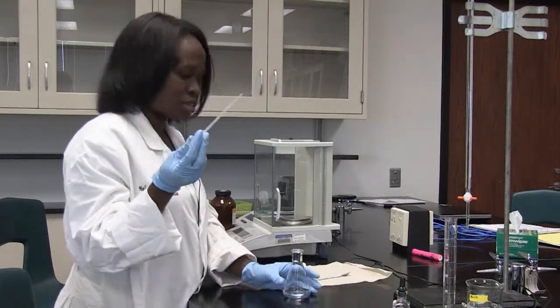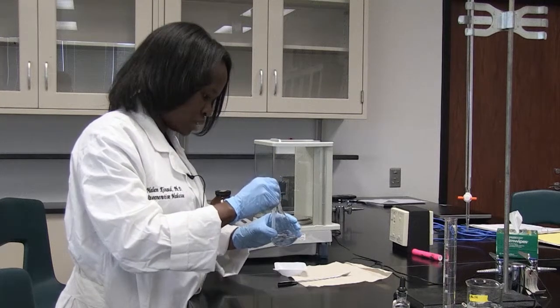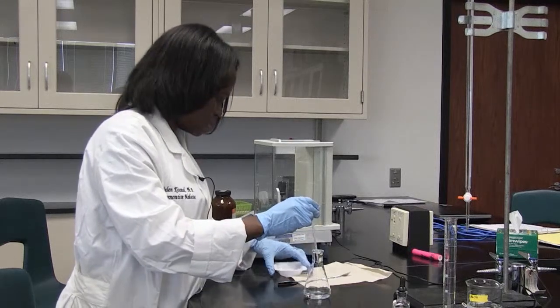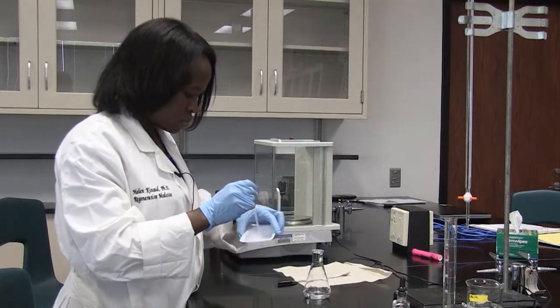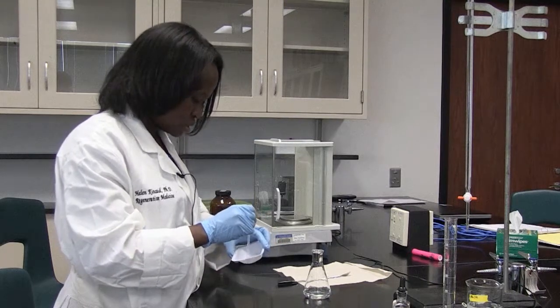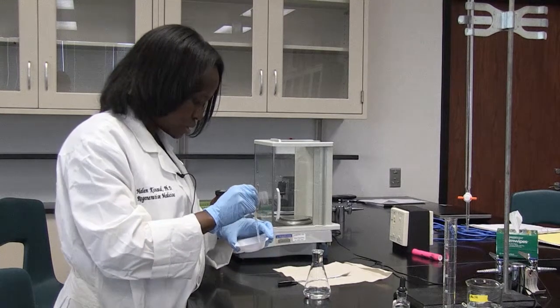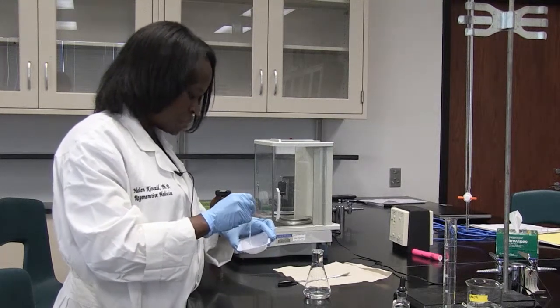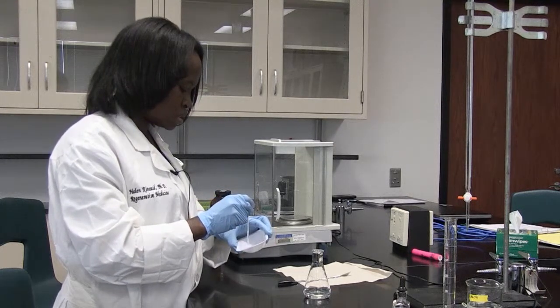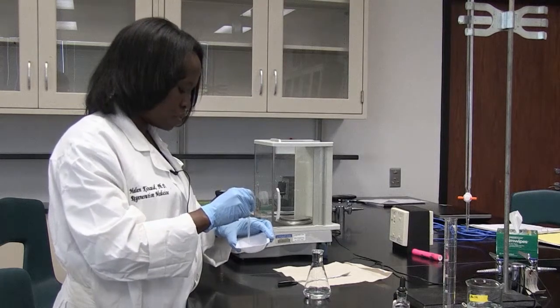This is a clean transfer pipette, so you make sure it's clean. You take up some of the solution, put it in your boat to rinse it so that you can get as much of the solid as possible out. If you want accuracy in your data, it's best to do this so that your readings won't be too far apart from each other.